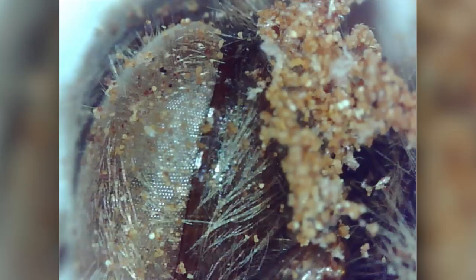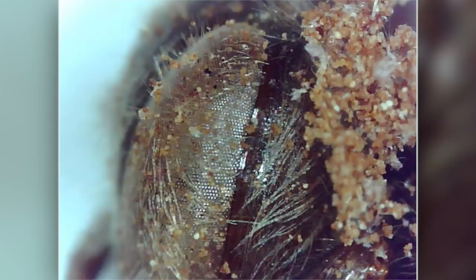Looking even closer at her eyeballs — look at that eye! What's so amazing is that firstly, even a honeybee's eye is hairy, to help trap that pollen — yes, they have hairy eyes. But also, unlike us who have one lens per eye, honeybees have compound eyes: hundreds and hundreds of tiny eyes all connected to each other, each looking in a slightly different direction, and together they give the bee its sight. If you want to learn more about compound eyes, check out our video 'Why is it so hard to catch a fly?'